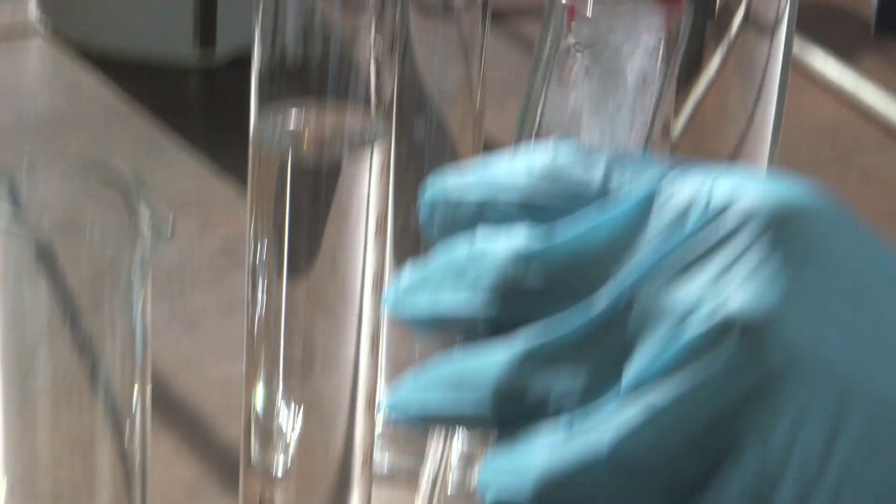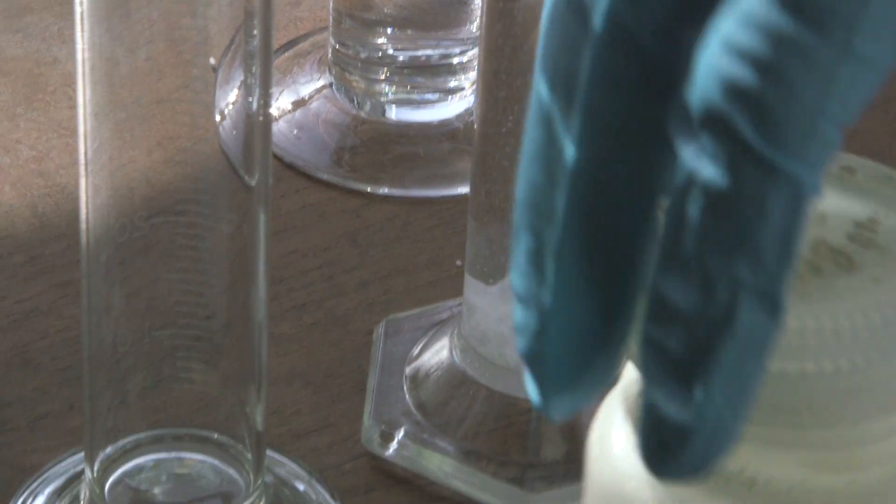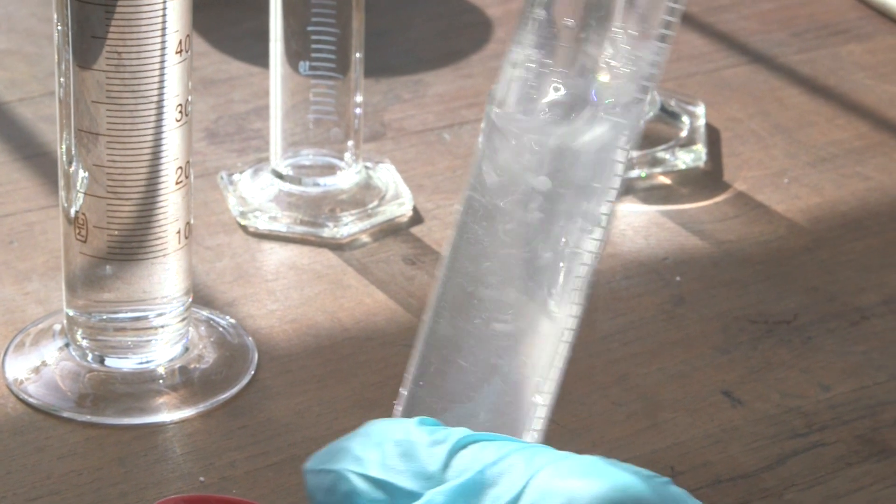So I looked up some recipes and it talked about controlled pH precipitation of the compound, but we thought we'd just try it without controlling anything.